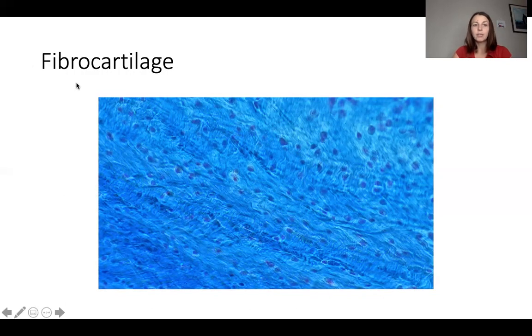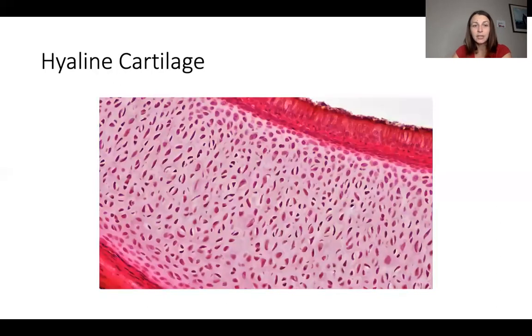Now we're into the cartilages. Fibrocartilage. Fibrous is dense. It happens to be dyed blue, so when you see it, you'll be able to recognize this slide as fibrocartilage. Mostly it's going to be the dense cartilaginous tissue, right? And what we don't have is that ground substance with cartilage. Here you get a little bit. This has a shiny appearance.